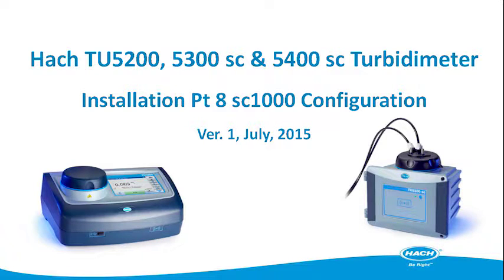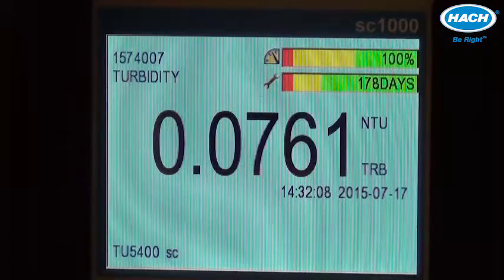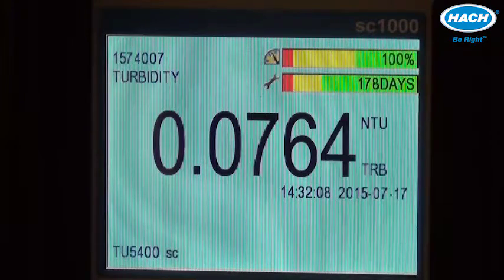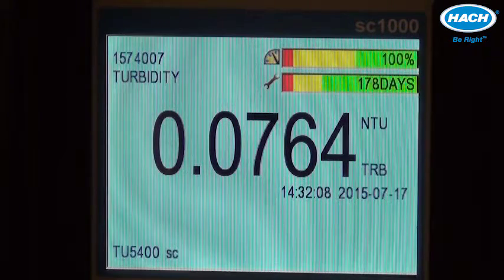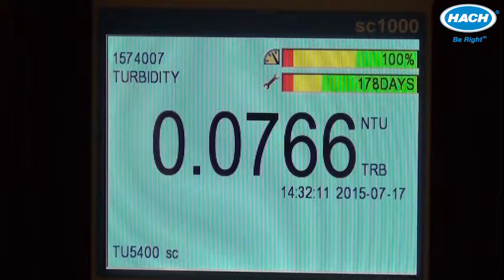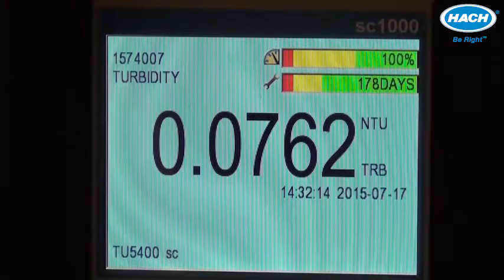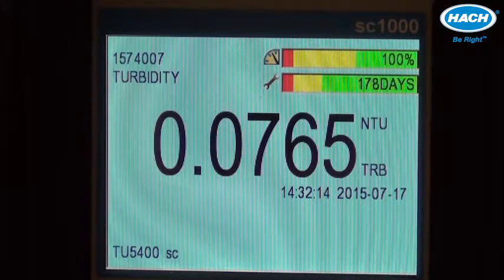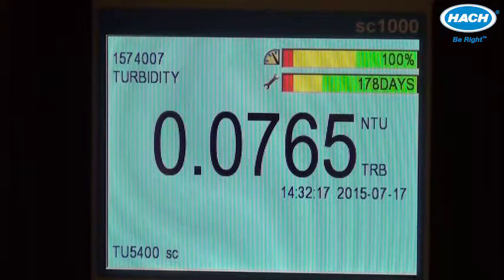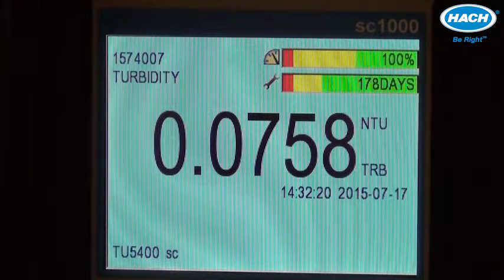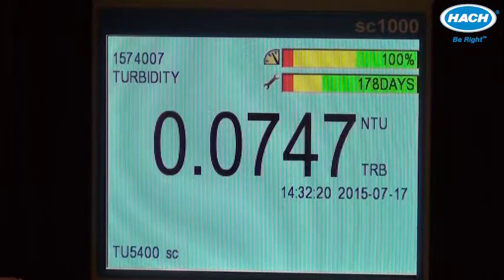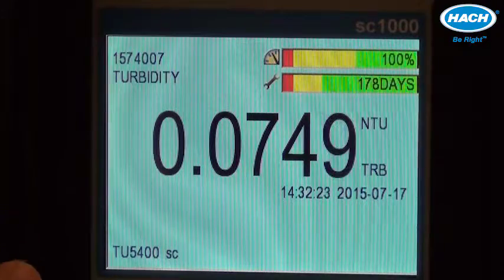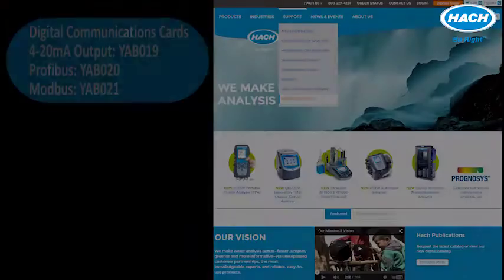The last item of installing the TU5400 process turbidimeter is configuration of analog or digital outputs for communication of the turbidity readings to a programmable logic controller or other control system. We'll demonstrate the analog output settings on the SC1000.